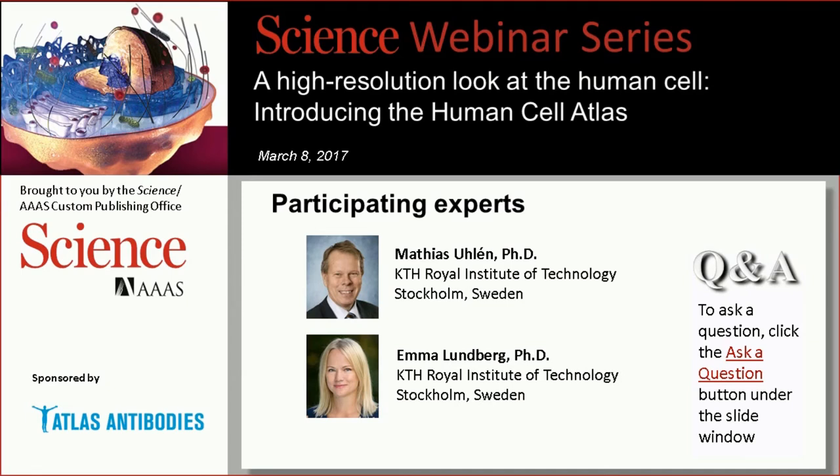So we can't really compare two different antibodies and say that this protein is more strongly expressed than this protein. We can't compare protein to protein, but we can compare within one image. And what we can also say is that the signal in our images is not dependent on the total concentration of the protein, but rather on the local concentration of the protein.